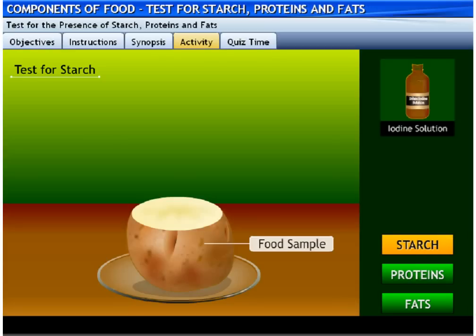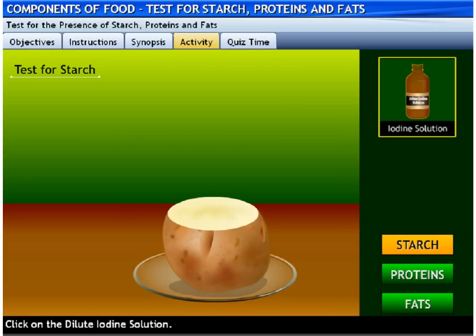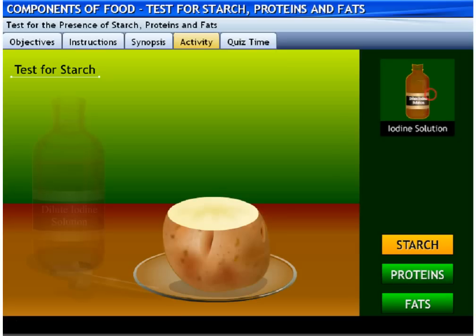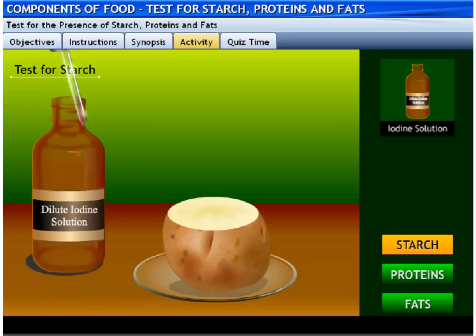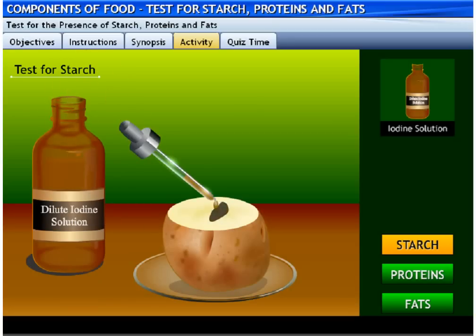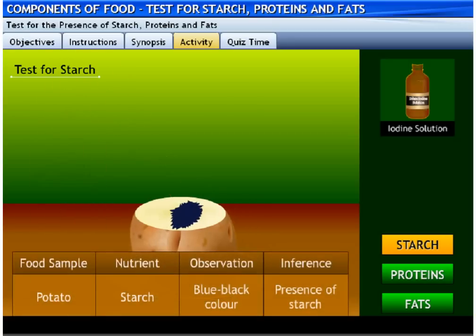The food sample to test the presence of starch is kept ready. Click on the dilute iodine solution to pour 3 to 4 drops of it on the food sample. The solution turns blue-black in color, indicating the presence of starch in potato.